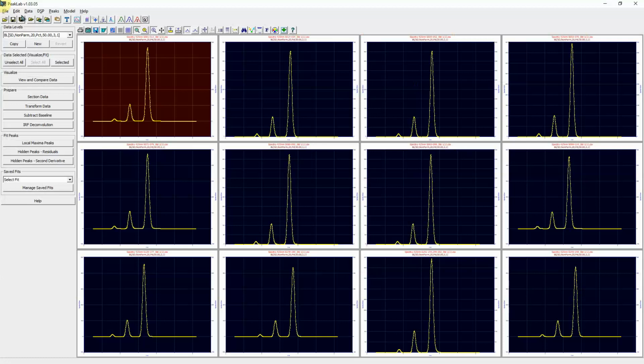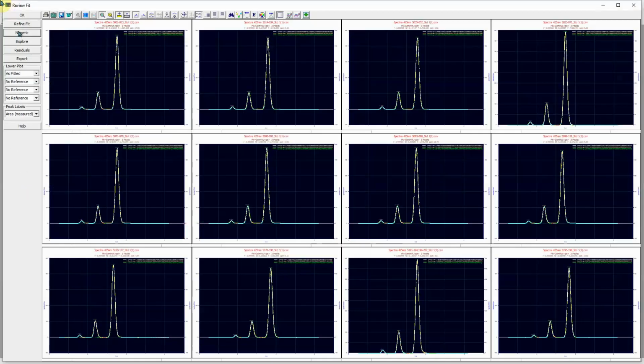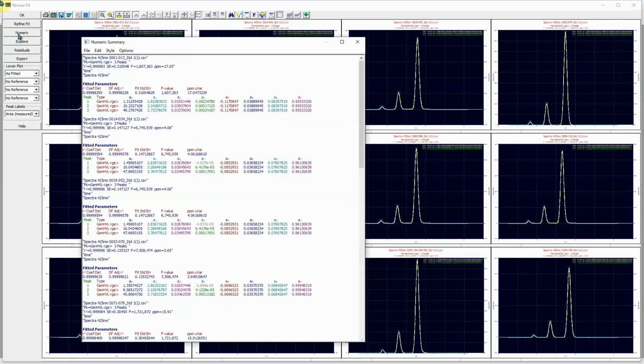We will select a fit previously made of these 12 data sets. It uses a once generalized HVL model with a GE IRF. This is the instrument response function that contains the sum of a half Gaussian probabilistic distortion and a first order exponential kinetic delay. The 12 fits range from 3.2 to about 17 parts per million statistical error. Excellent fits.